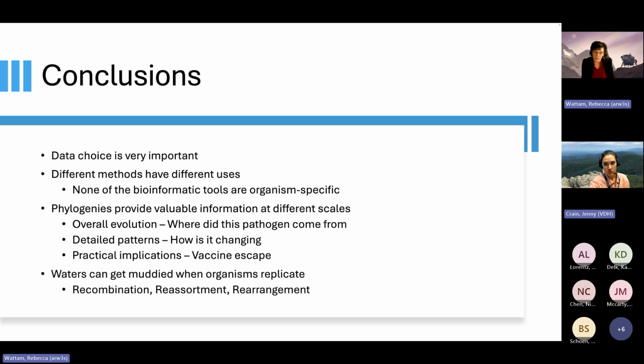Right. And when I do that, even with bacterial, like that thing that showed the Staph aureus genes, 1,459, you just concatenate those together to make an extremely long alignment. So they're all together. And in that, you can also include protein sequences and nucleotide sequences as part of the alignment. That's what we do at BBBRC for our bacterial trees, is we take gene sequences and protein sequences from the same gene. So it's like giving extra oomph to the things that are causing changes in the protein sequence.